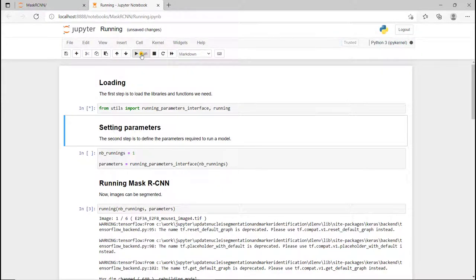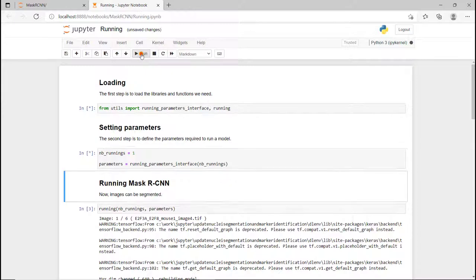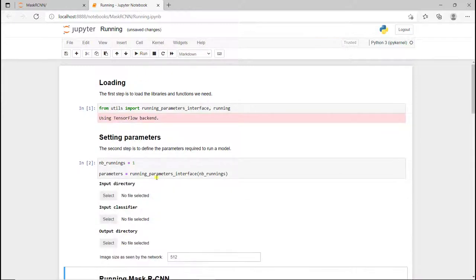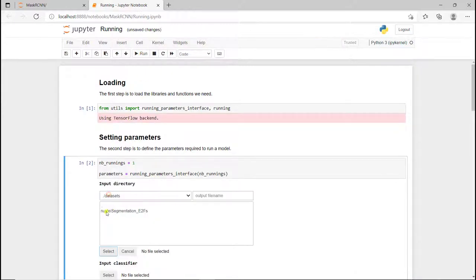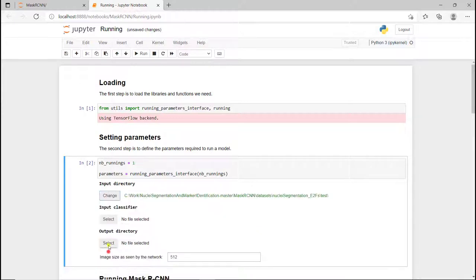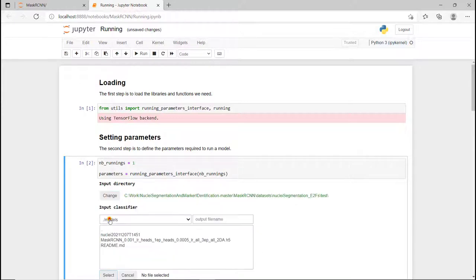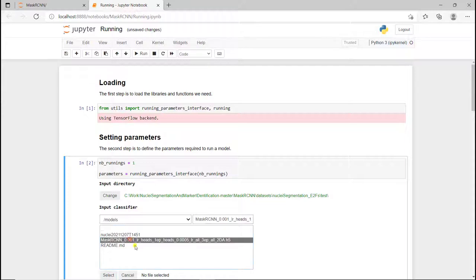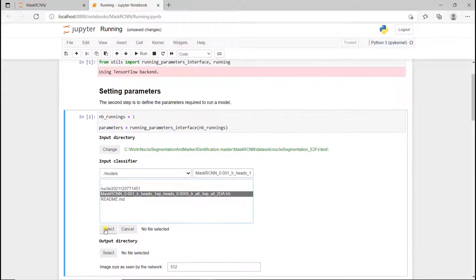Load everything we need. Define the parameters. Here it's going to be input directory, the images we want to process, the ones that are in test. Input model is going to be the one we just trained here.